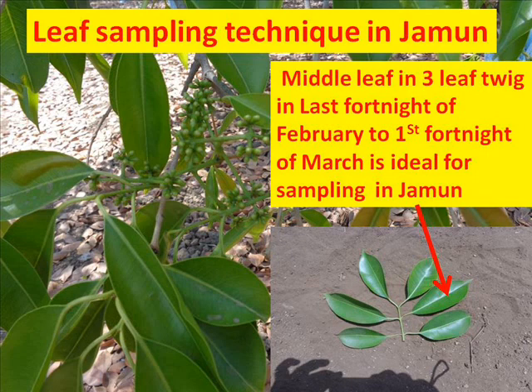From January itself we started observing how the leaves are falling, how young leaves are coming, and what percent of the entire tree has young leaves, yellow leaves, and dried leaves. Sometimes even after completely yellowing, leaves don't fall and keep drying. Some fallen leaves, some young leaves, and one-month-old young leaves are also there. So we collected samples in many ways.